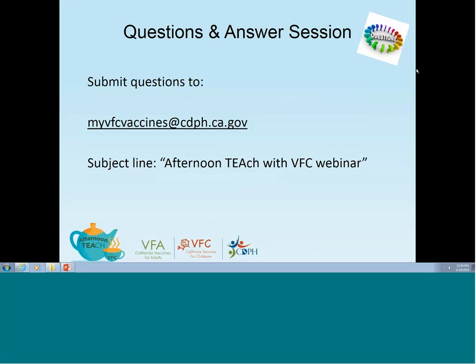On a related note, I just noticed another question that just came in related to batteries. How often should I be changing the batteries? And I know it says on a regular schedule. Once again, like Michelle just reiterated, I think taking a look at your instruction manual for your data logger is key. We often recommend from the program to actually take a look at changing batteries approximately every 6 months. The VFC program usually, when it's time for daylight savings time changes, we actually include a recommendation for you to also check the batteries on your devices as a good reminder.